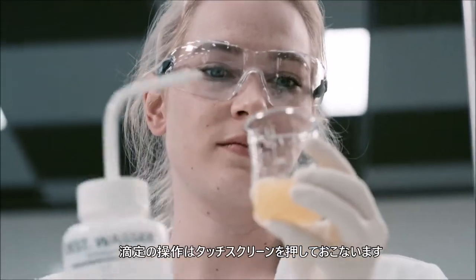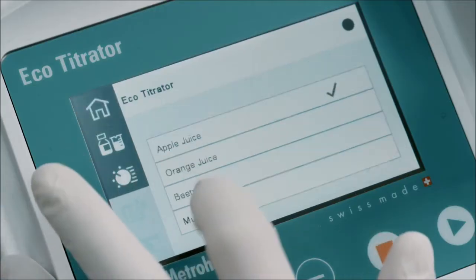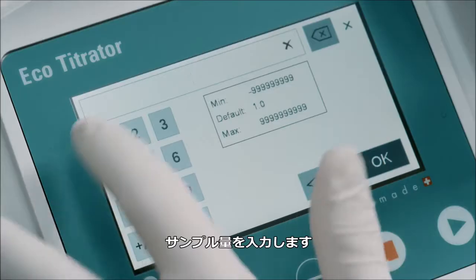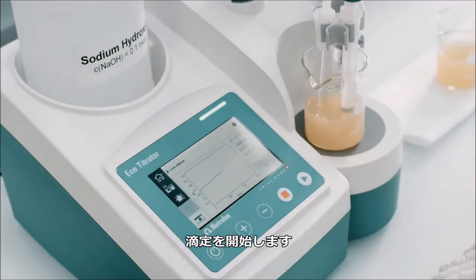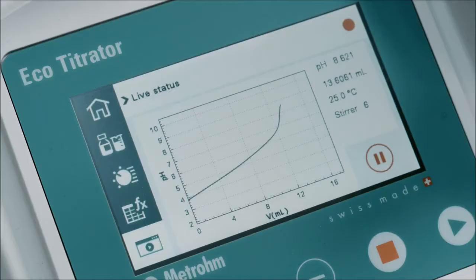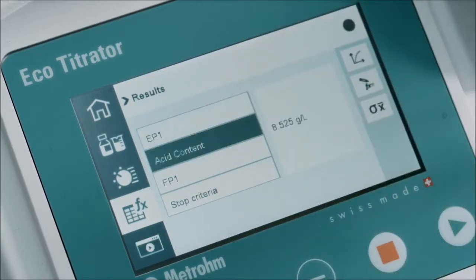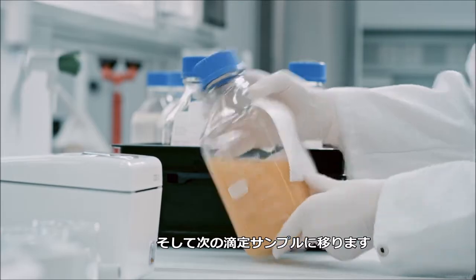Your staff can now perform titrations at the touch of a screen. Select the required method. Enter the sample size. Start the titration. Read and print out the result. Then continue with the next sample.